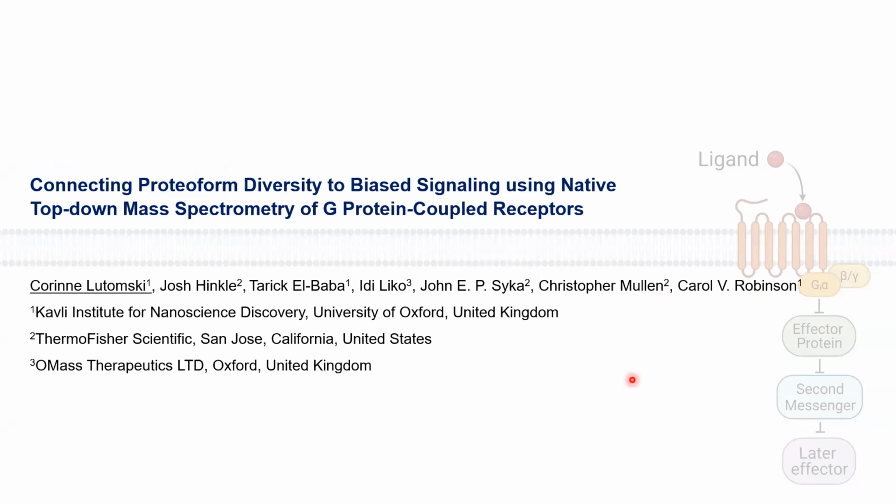So my talk today is on the end goal of connecting the proteoform diversity in GPCRs to their bias signaling output. And the way that we're going to do this is using native top-down mass spectrometry, and I'm going to walk you through the story as to how we're developing that and how that's our end goal. And so this is a collaborative effort.